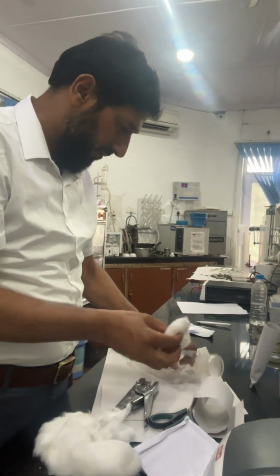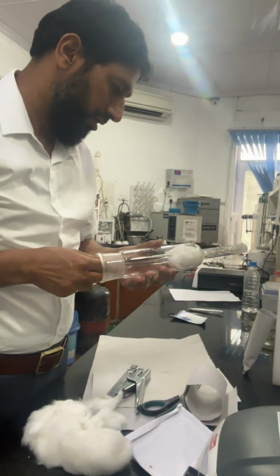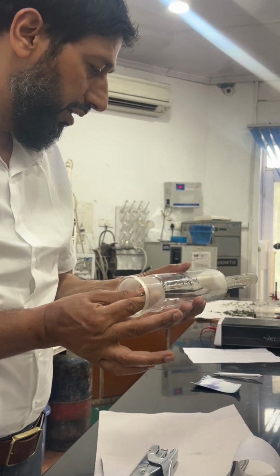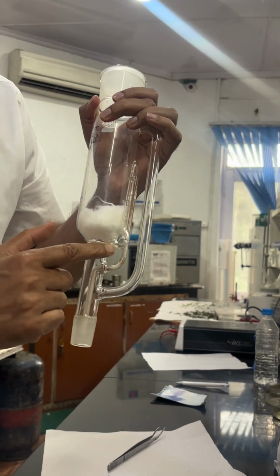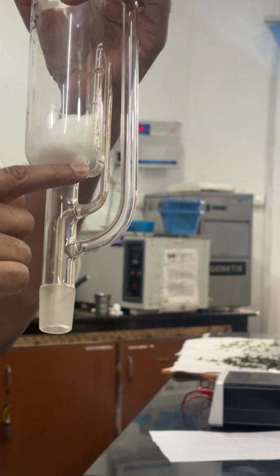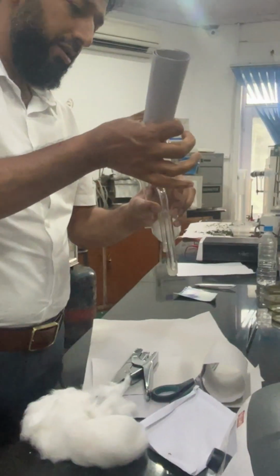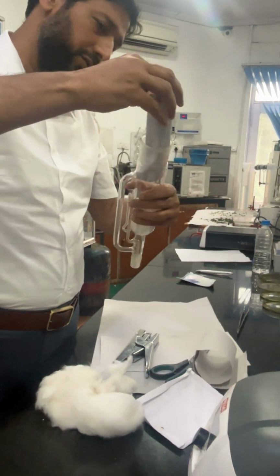So we put some cotton, because this cotton will not allow it to block. We don't have to put it tightly. We just simply press it a little bit. And now your cotton has covered this place. So even if some plant material falls off in this, it will not go in and block this. So to be sure, we take this thimble and we have our plant material. You have to see that you don't break it.